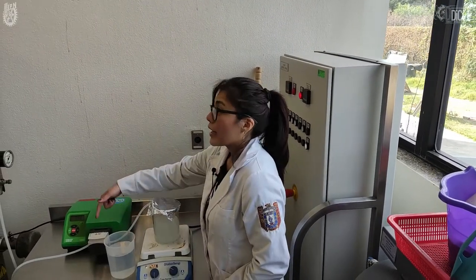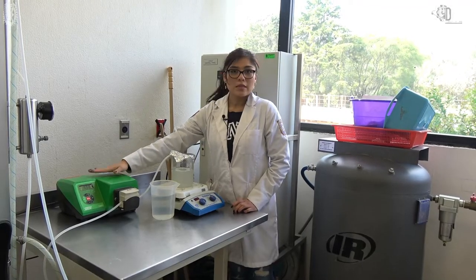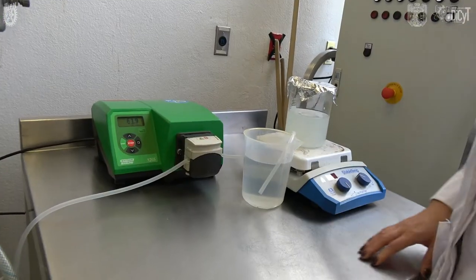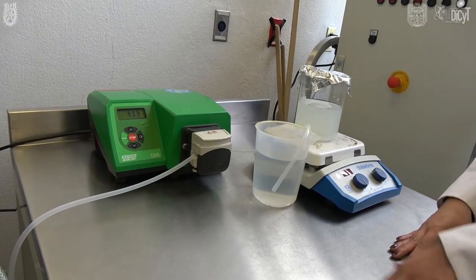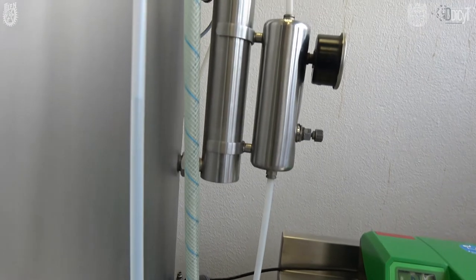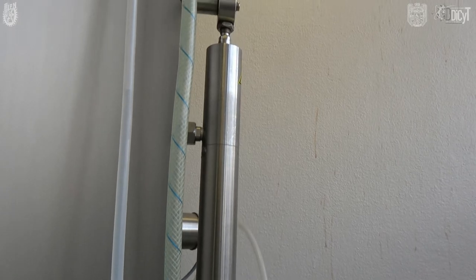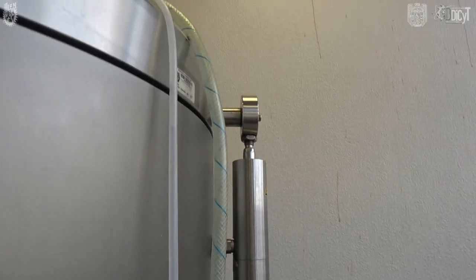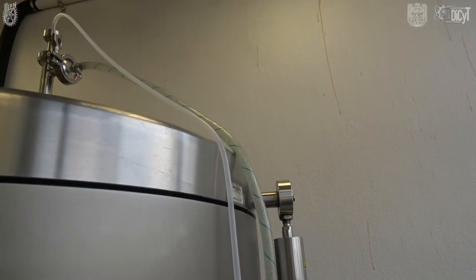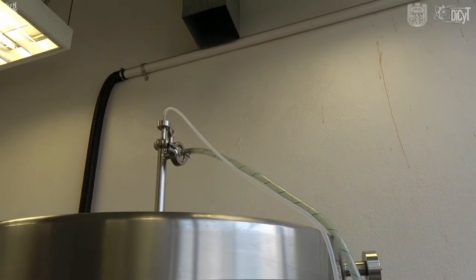Este líquido va a viajar a través de esta manguera y, con ayuda de esta bomba, va a ir regulando el flujo. Al llegar aquí a la boquilla del secador, va a entrar todo el líquido y en esta cámara se empiezan a utilizar temperaturas altas, y una corriente de aire caliente va a ir secando el líquido para obtener ya el polvo seco.